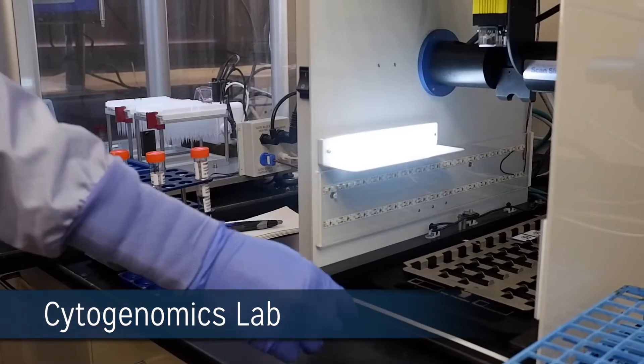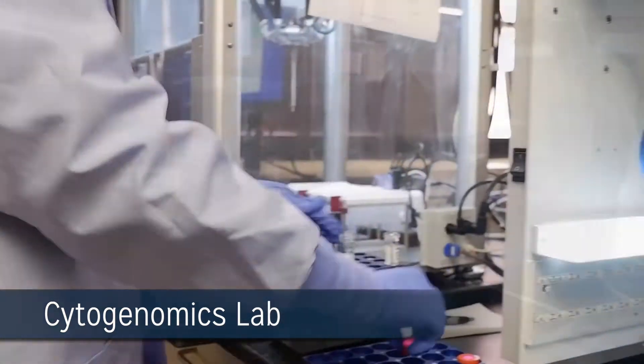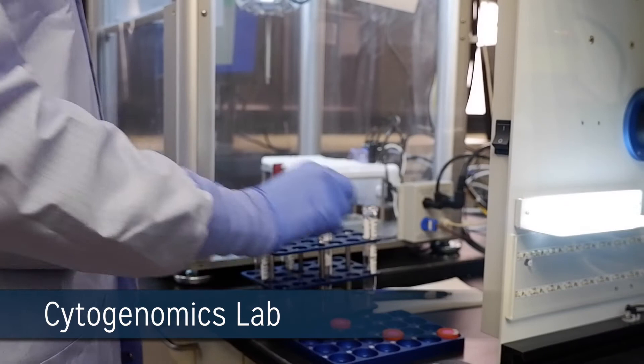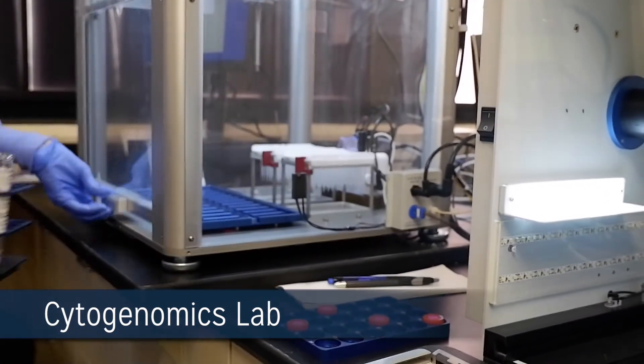HFH Cytogenomics is the first cytogenomics lab in the Midwest to acquire and utilize automated slide dropping and staining equipment developed by Cygene and Art Robbins instruments. Barcoding of the sample tubes and slides ensures accurate, efficient, and consistent sample preparation.